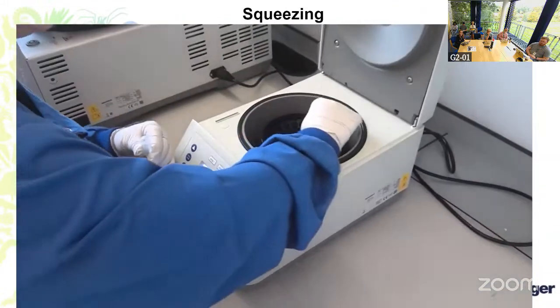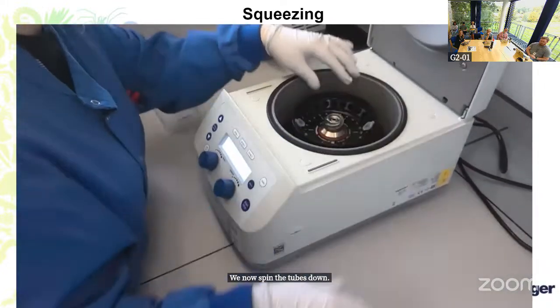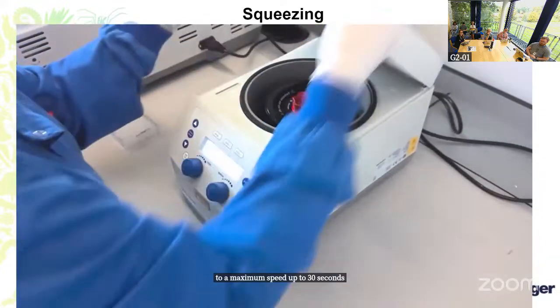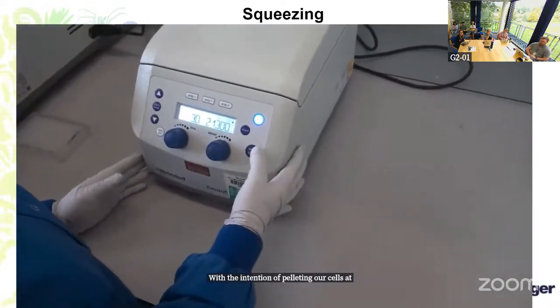So once this has been done, we now spin the tubes down at maximum speed for up to 30 seconds, with the intention of pelleting our cells at the bottom of the tube.